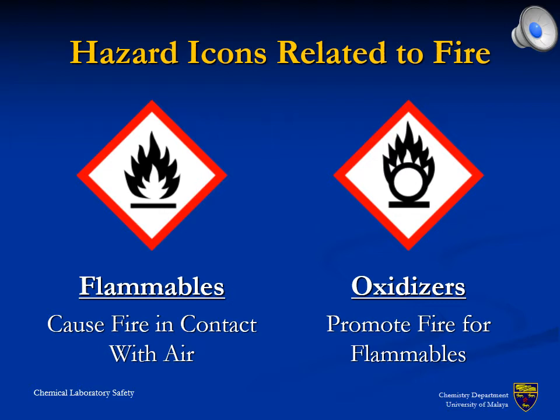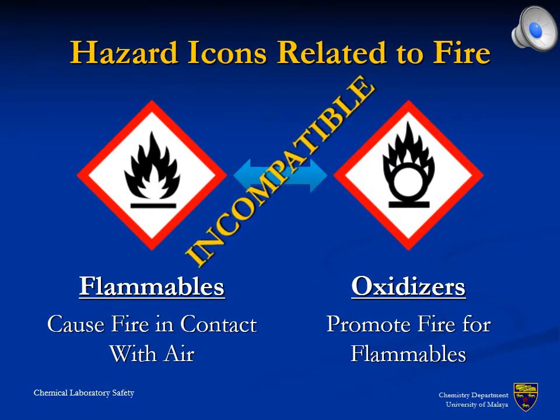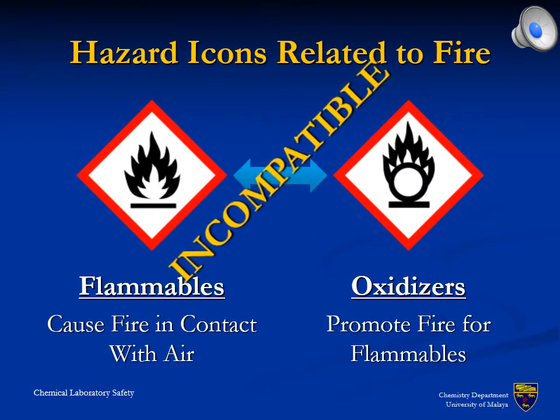While the symbols on the hazard icons are mostly self-explaining, attention should be taken on the icons indicating flammable and oxidizing compounds. Both icons associate the material with fire hazards. However, a differentiation of the icons is essential, since flammable and oxidizing compounds are not compatible and, therefore, should be kept away from each other. The difference in the icons is the central ring resembling an O in the hazard icon for oxidizing material.